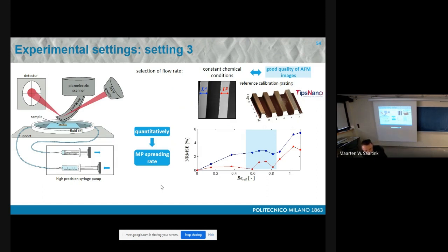No, but so far, when you finish the experiment, you analyze the water. Yes, that's also the capability of analyzing it, but not now. In the future. No, that's a different story. So what Shad is referring to is that we just acquired a new instrument, an atomic force microscope. Now we have a new atomic force microscope with also Raman capability.